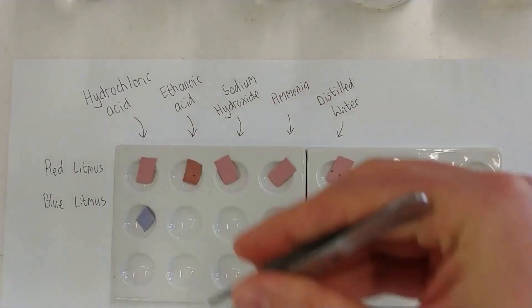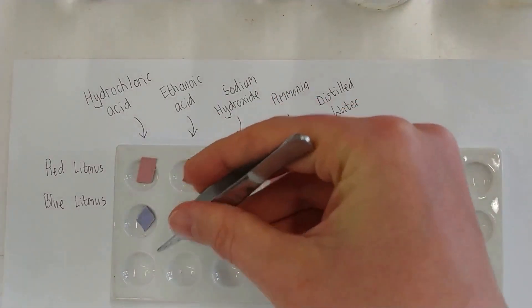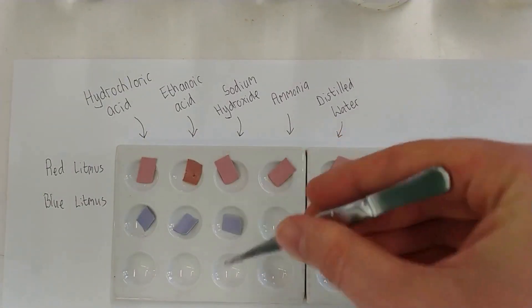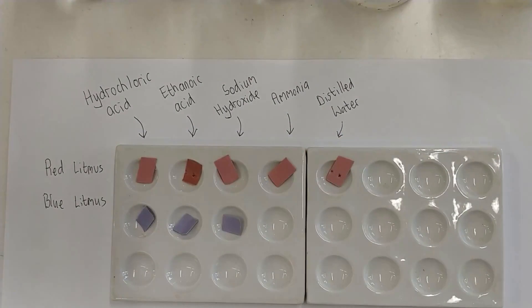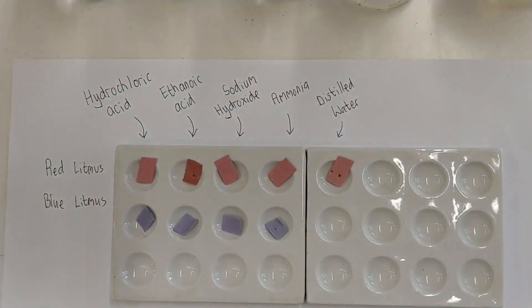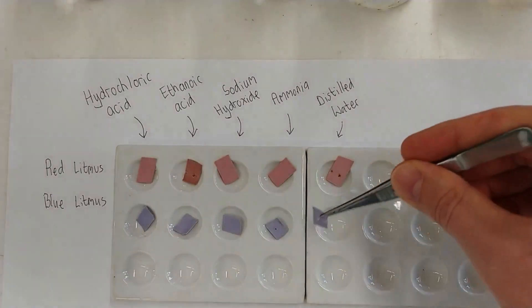There was a little bit of trouble doing it with the blue one, so it took longer, but thanks to movie magic, I just cut it out. But we just want a small amount in each and then onto the paper, we are going to drip a drop or two of each of the substances that you can see.